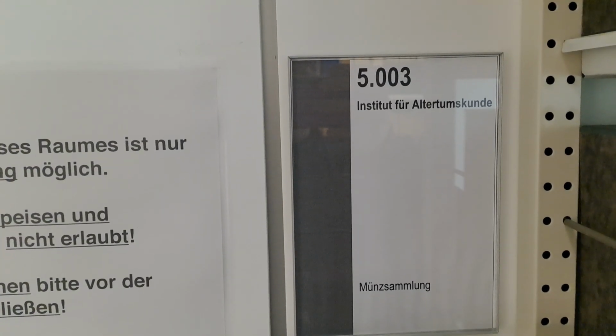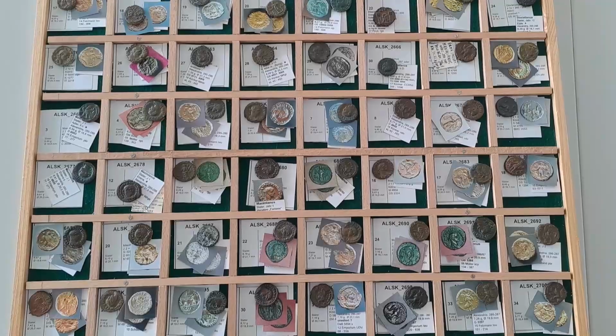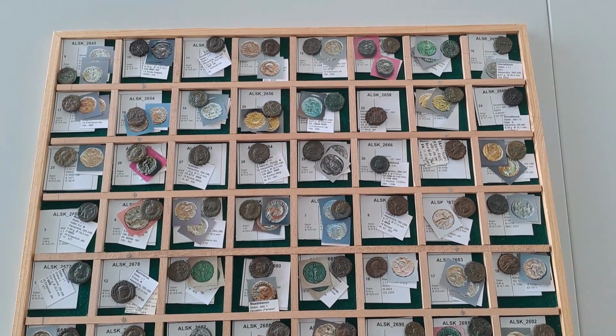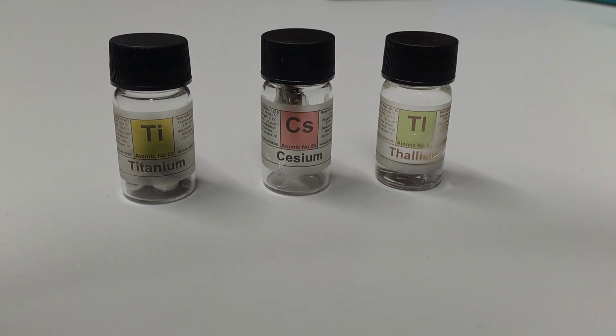For this, we are changing the setting today and visiting the coin collection of the Department for Classics at the University of Cologne. This collection is overseen by Professor Dr. Stab, who, together with Malte, will guide us through the measurements. Of course, I've brought some samples from home.